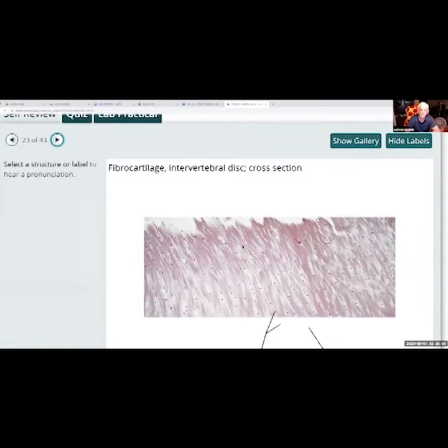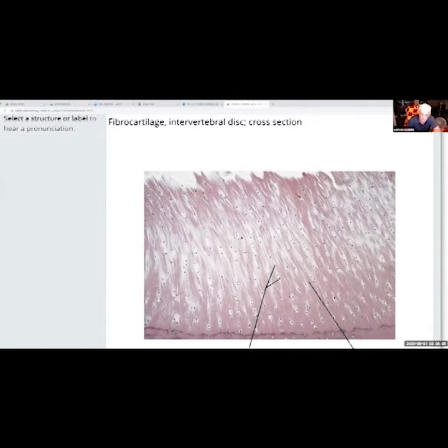Okay, this is between your vertebrae. We haven't talked about the vertebrae yet, but on your vertebrae, the bones don't hit bone to bone. There's what's called a cartilaginous pad in between each vertebra in your body to cushion when you walk, when you jump, when you fall, whatever. It cushions the blow between the vertebrae so they don't hit each other. When that blows out, the bones hit bone, that's when you have a problem. And you have a ruptured disc, things like that.